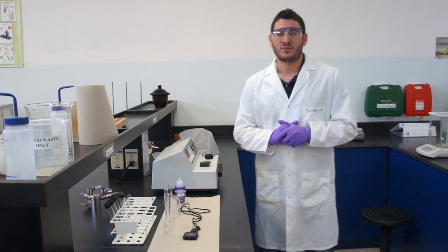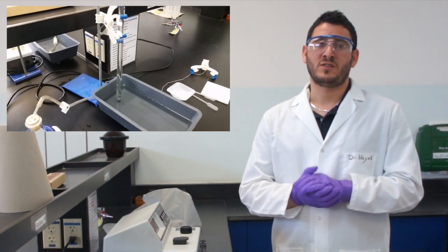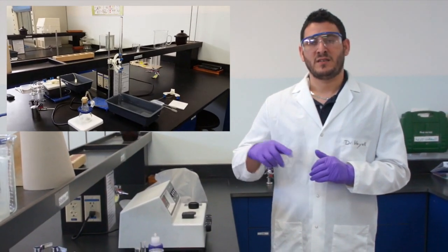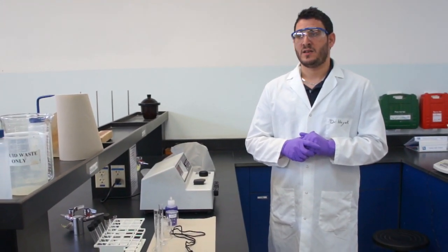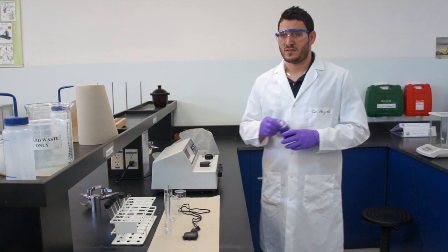Application 11 is going to be the last experiment for trimester 3. Again, this is about chemical kinetics. In the last experiment, we determined the rate order of the reaction by collecting the gas that evolves out of the reaction. However, today, we will be monitoring the concentration of the reactant from the color intensity.